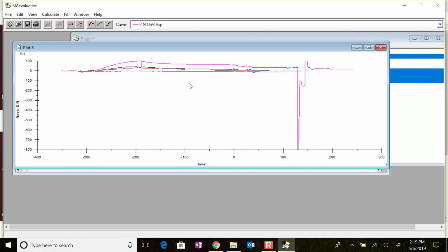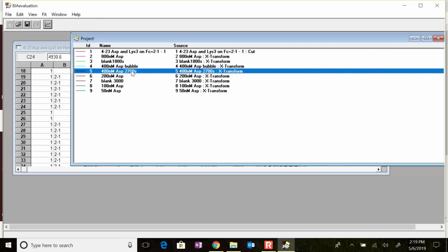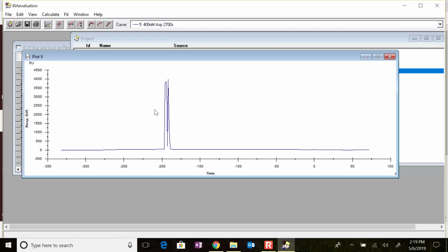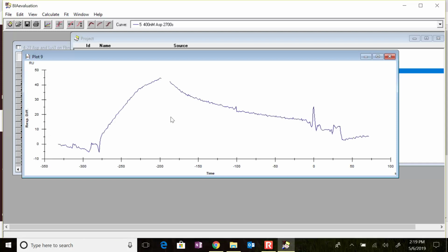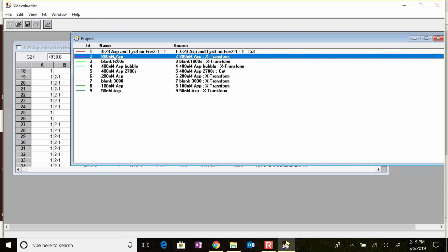I can go back, by the way, and I can open up the blue one, and I can remove that bubble if I want to. Actually, let me show you how to do that, because it's real easy. And it'll mean that I'll have to zoom less. See, I can just select this bubble, and I can control exit out, and there's my shark fin. So that bubble really was just getting in the way. It wasn't doing anything. Now I'm going to shift select again.